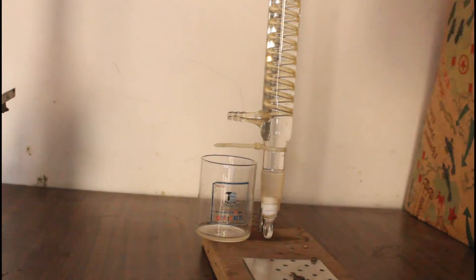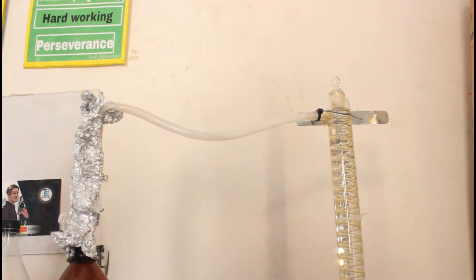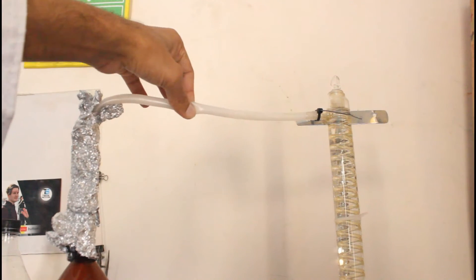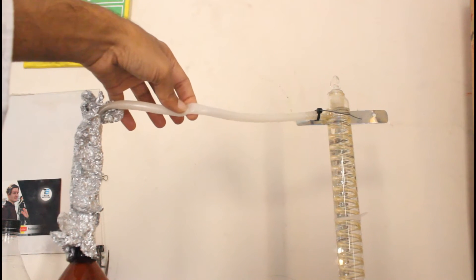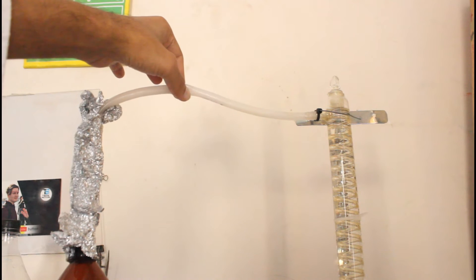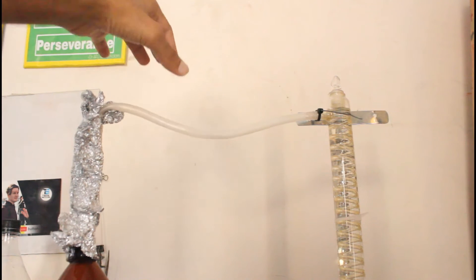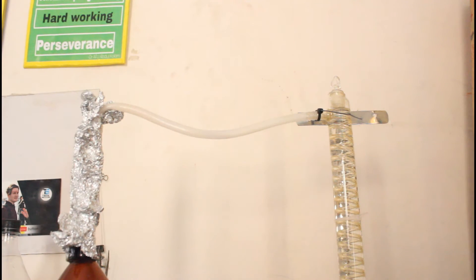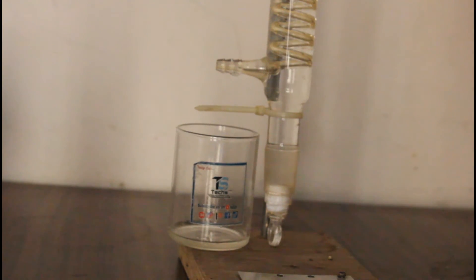And now we can see the liquid collected at the bottom. Using this rubber pipe is a bad idea. Actually I had to use a glass tube. The liquid getting collected at the curve but still we got some of the liquid.